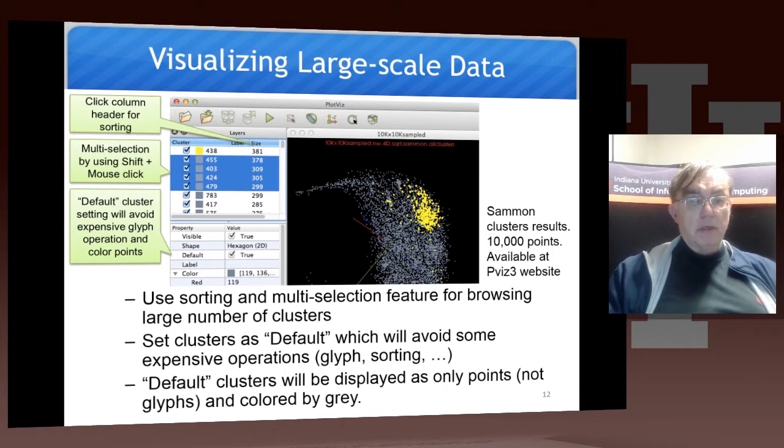Well, when you're dealing with a large data set, the so-called default option is pretty useful, because the default does not use glyphs. So if you want to just look at glyphs for a small sample of the points, then you can set all the other points to be default. Although they then have this miserable uniform gray color. So a default cluster all have the same color. So it's not a perfect situation. We probably need a better approach there.